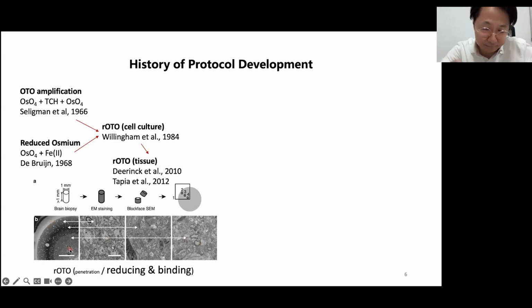This pattern is actually very disappointing, because it tells us that no matter how long you prolong the incubation, you will always have this pattern. It's not due to insufficient incubation time. There's something wrong, or something produced by osmium mechanics.